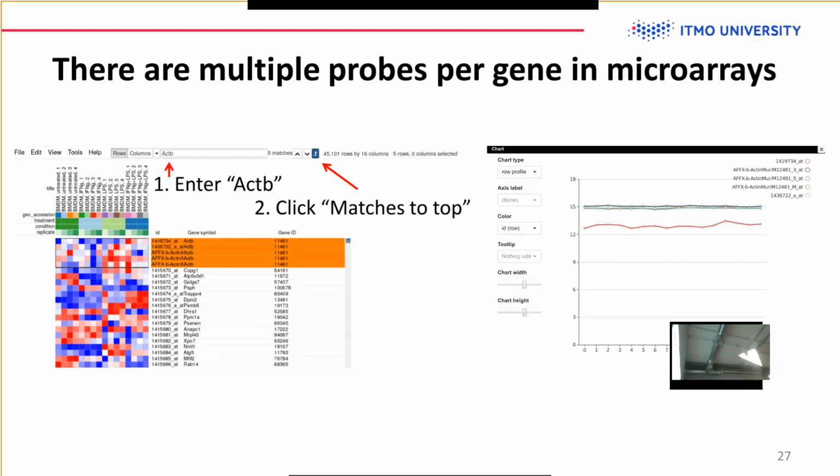So if you have, like in here, these 5 probes, and 4 of them are more or less similar, but the 5th is the bad one, and the bad one has lower expression. And there are some biological and technical reasons for this as well, like in microarrays or RNA sequencing data.